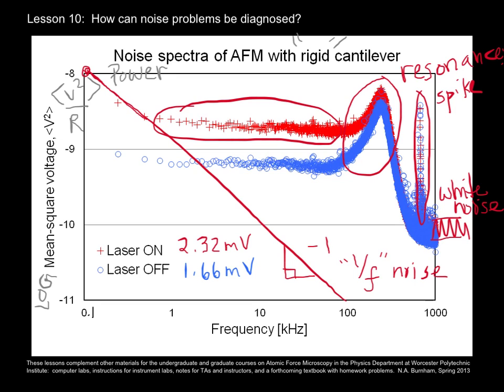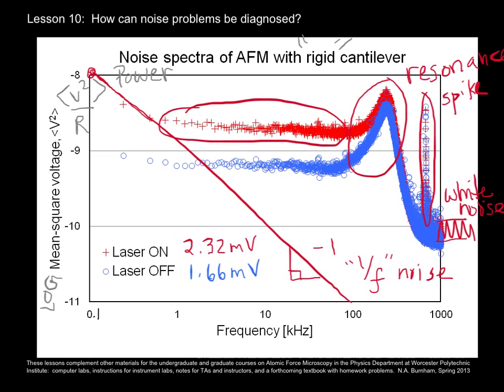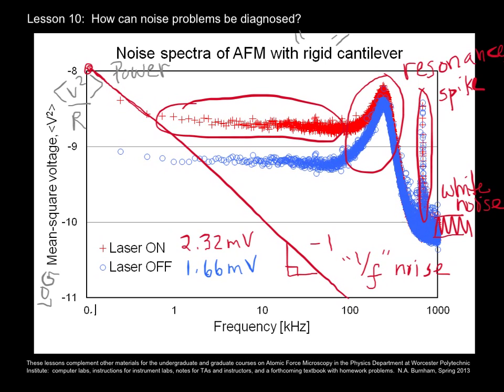And oops, I'll add the 0.1 there. By the way, if we wanted to turn this into a log frequency, remember that log of 1 is 0, log of 10 is 1, log of 100 is 2, log of 1000 is 3, and log of 0.1 is -1.